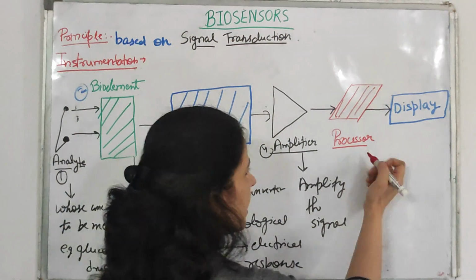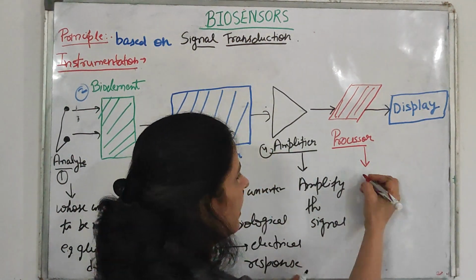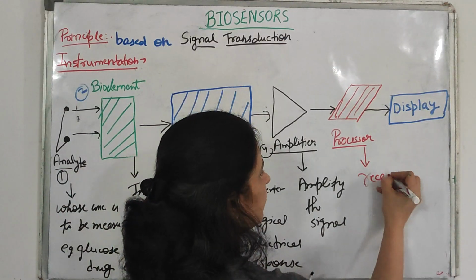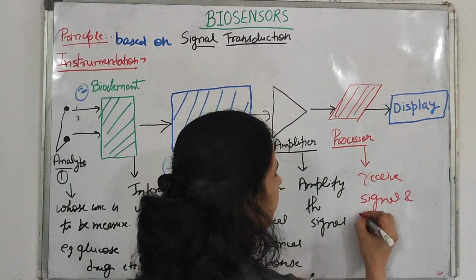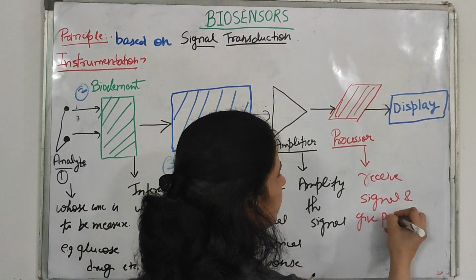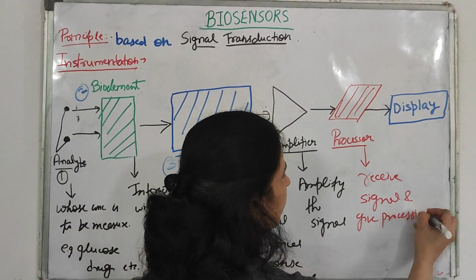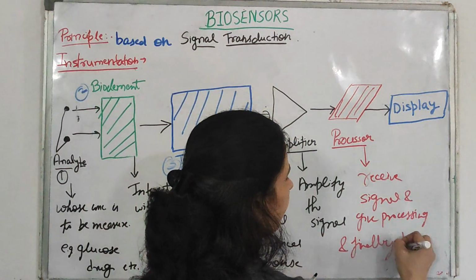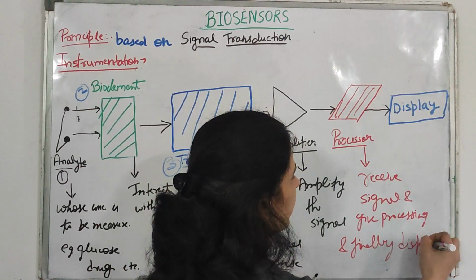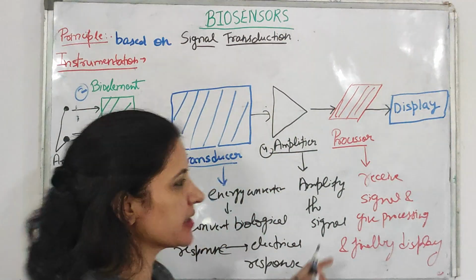And what is the processor? The function of the processor is to receive the signal, process it, and finally display it. Processor means processing something, as the name suggests.